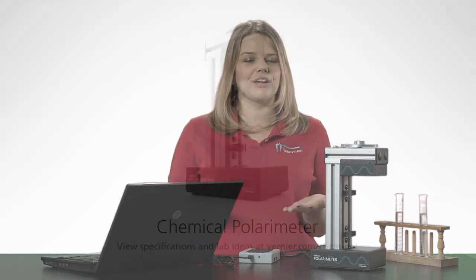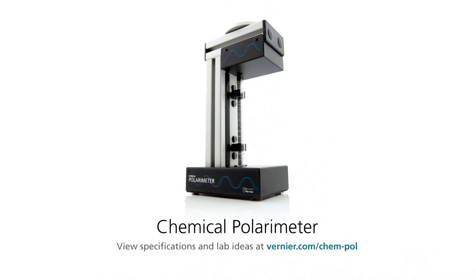A chemical polarimeter is a device for measuring stereochemistry of molecules. Today I'm going to give you a brief introduction on how to use the polarimeter.